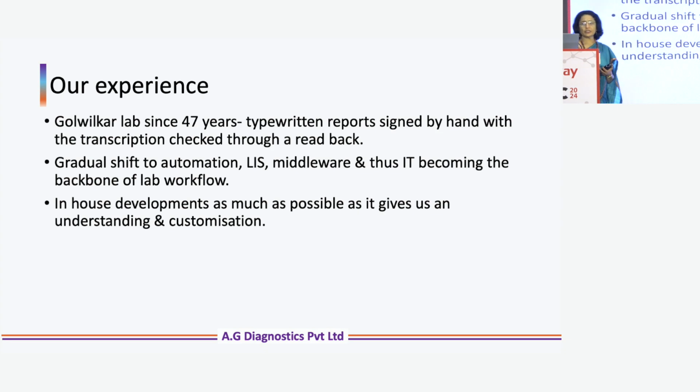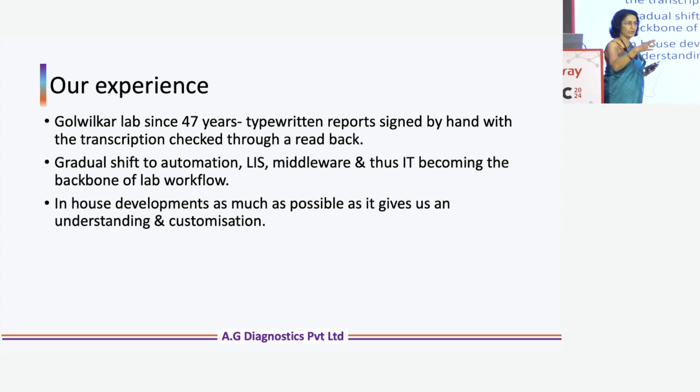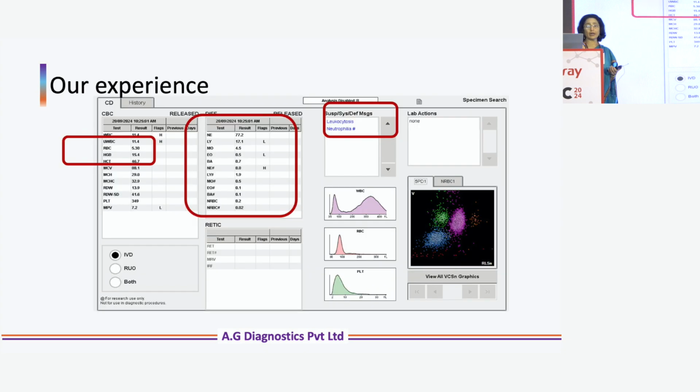Now the gradual shift to automation, LIS middleware, and thus IT becoming the backbone of lab workflow, this has changed. So now all of us have a much easier life in reviewing reports as well as signing them out. Throughout all these years, we have done a lot of in-house development, as much as possible. We have not relied on ready-made software coming in for anything. We have always believed in trying to develop them ourselves so that we get the required customization for our lab. What is applicable for our lab?